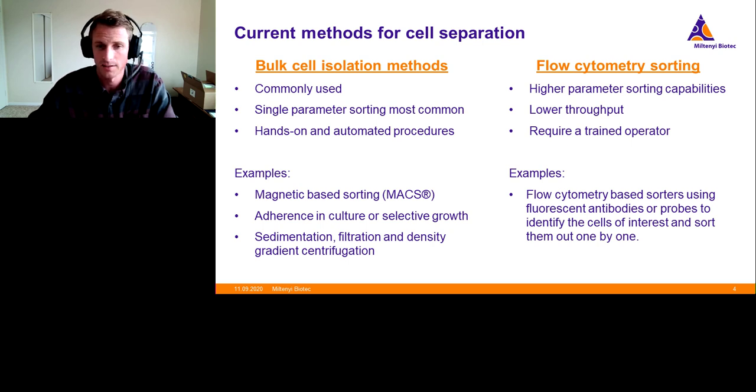Some drawbacks to that technique: I've already talked about the aerosolization part, which we'll go into more detail about, but they also require a quite trained operator to use these technologies. Many of you probably use a cell core or a flow cytometry core, and those are trained experts that spend a lot of time in the morning setting up their machines, a lot of time at night shutting them down, and then will be monitoring them throughout the day. So it can be a prohibitively difficult technology to take on into a lab that doesn't have the expertise.